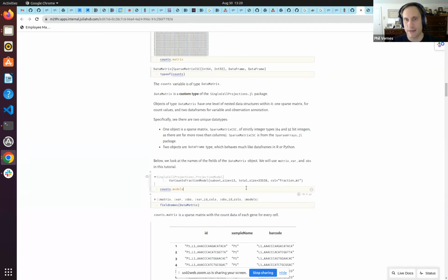So it makes it easy to reproduce and track the transformations and changes you made and your progress using what they call the projection model, which is derived from the concept of a projection in vector spaces, but that's not the primary concern.